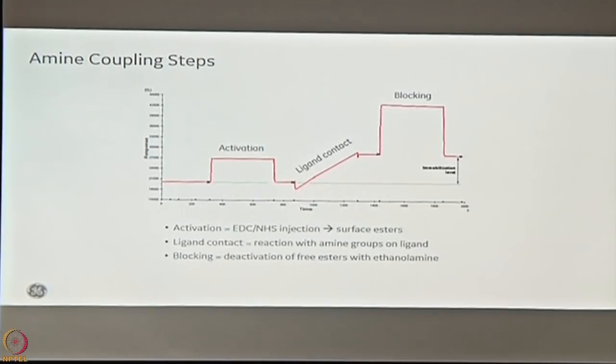This one that you are looking at is actually the steps of your immobilization. So how do we immobilize? First we activate our surface using EDC NHS, and don't ask me what's the full form, because I really cannot remember the EDC NHS. What it does is activate the carboxyl groups into a reactive ester group. Okay, and that's where you're seeing the EDC NHS being pushed.